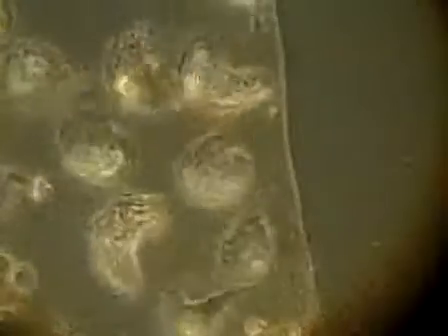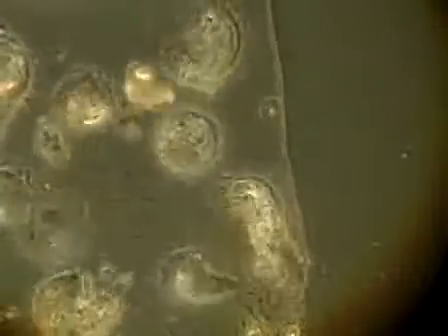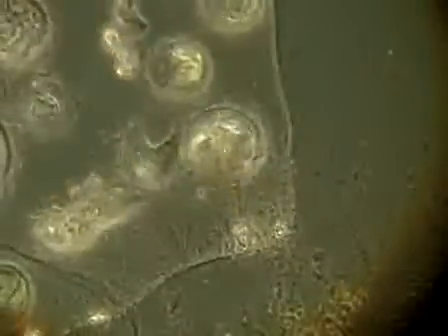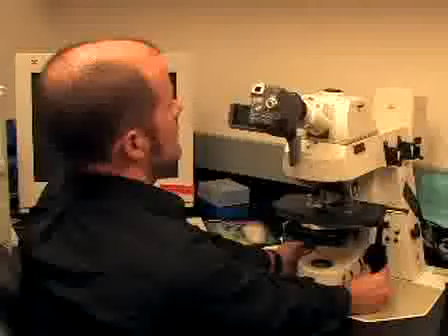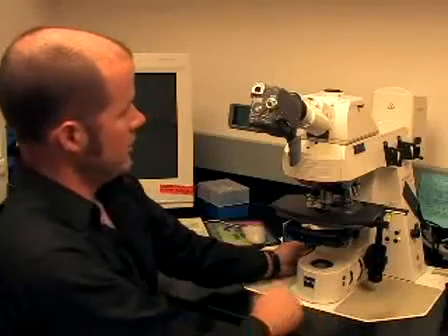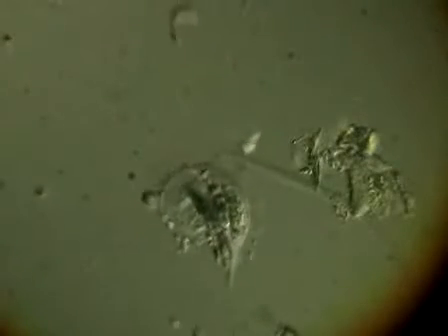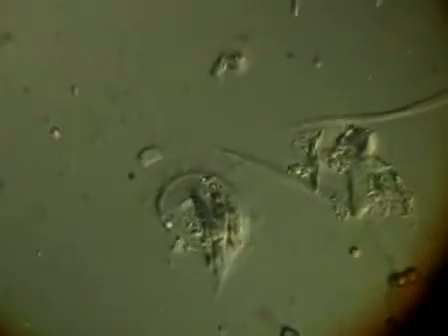What I can do is compare phase contrast. Looks good. This is this edge contrast. It also looks good. And it's just a matter of taste. And for some of the thinner cells, this phase contrast looks better. Actually, we see two protozoa here. One is this one in the center with these little frills, and the other one which looks like a bundle of sticks. And this DIC imaging really brings that out.